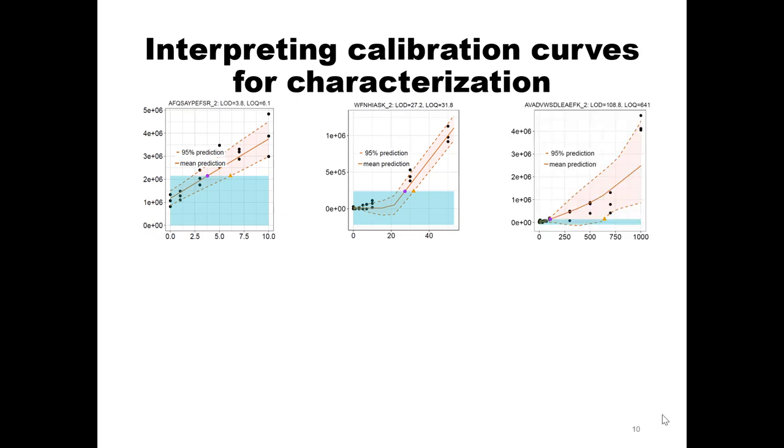The other thing you might get is you didn't quite go high enough to capture your LOD or LOQ. So that's what I'm showing you on the right here. This is an example of maybe a peptide where the curve is actually supposed to happen between these 2 points. You see way up at the top is where the signal is for this highest 1000 point. So you can imagine it's going to go up linear from there if that's where my curve point is. So on the left, I didn't go low enough. On the right, I didn't go high enough. And Goldilocks in the middle is where you would want your curve points to be.